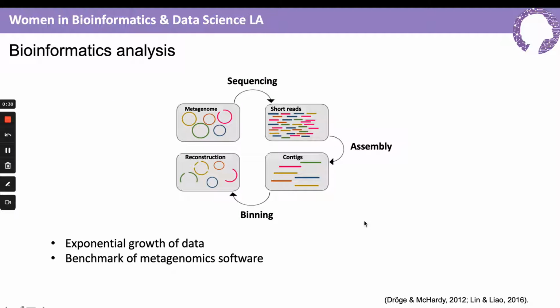Bioinformatic analysis of a metagenome sequence is divided into phases: assembly and binning. Assembly refers to the construction of consensus sequences, denominated contigs, from the short reads generated in the sequencing. To obtain a correct assembly, there must be plenty of overlap between the reads. On the other hand, the binning phase is a process where contigs are assigned to taxonomic groups.